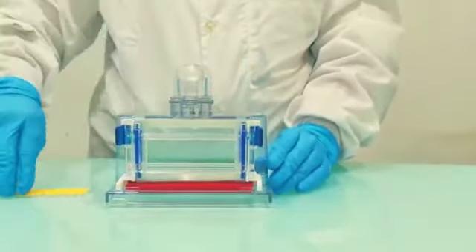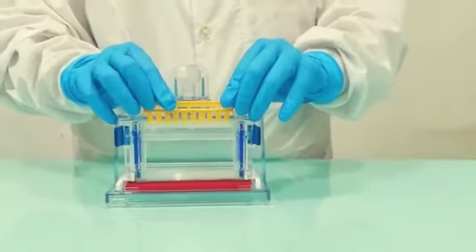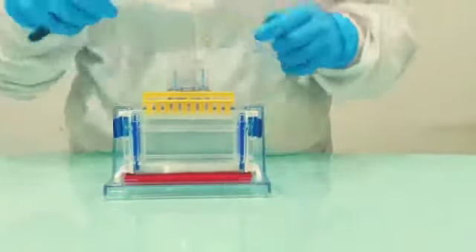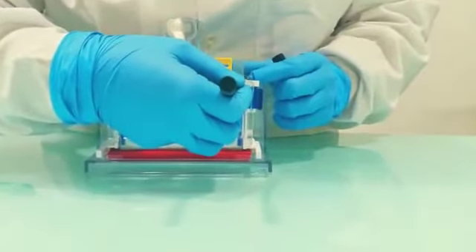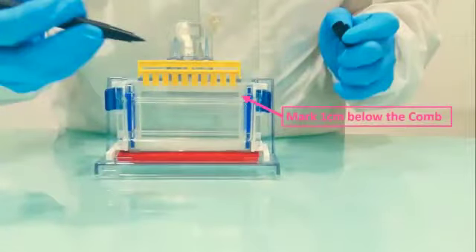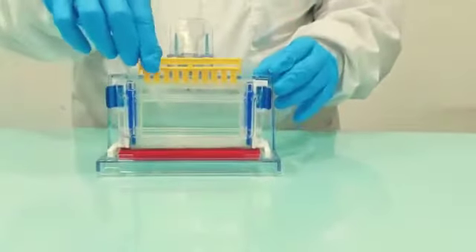When everything is done, attach it on the casting stand. Next, place a comb between the plates and make a mark about 1 cm below the comb. Take the comb out.